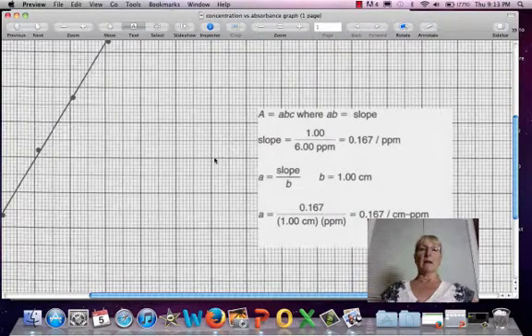So now having done that, let's pretend that we had an unknown. Let's pretend we had this time that the absorption I would know because I measured it off the machine. I had calculated the extinction coefficient because I had done so from a previous trial where I had calibrated it with known concentrations. I still know the length of the pathway through which the light has to pass on the cuvette, and the unknown is that puppy, concentration.